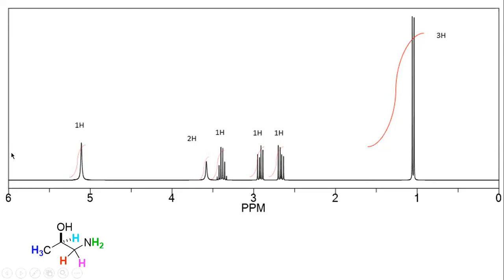All right. So the NH2 and the OH protons are here, right? You see that? That's integrating for one hydrogen. This is integrating for two hydrogens. And so the NH2 is here and the OH is here. We can pick those out right away because remember, I think I said it on Wednesday, those protons don't split, right? They don't couple. And so they don't get split into two lines or triplets or doublets or whatever, right? They remain singlets. So you can see here that those are those two protons. Now let's see if we can walk down the rest of them.